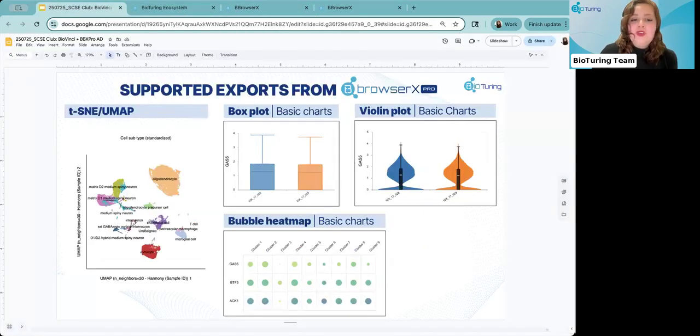So if I go into the case study introduction and a bit more on why we are focusing on neurodegenerative diseases, it's because Alzheimer's disease and Parkinson's disease really impose a growing global burden. And even though we have identified specific cell populations that can be targeted or have specific mechanisms that might drive severity or further neurodegenerative symptoms, we're still not able to really understand the divergent pathologies within these cell types specifically, and how these mechanisms might change these pathologies further.